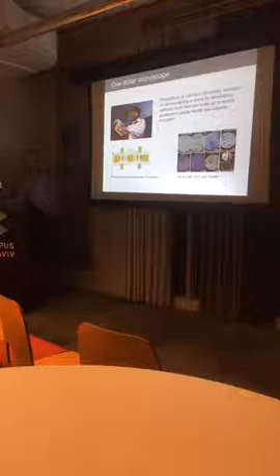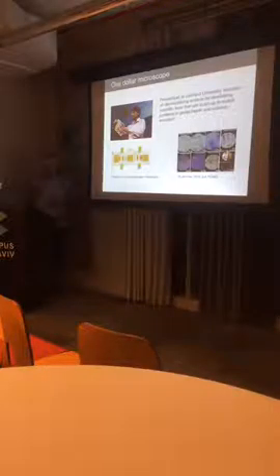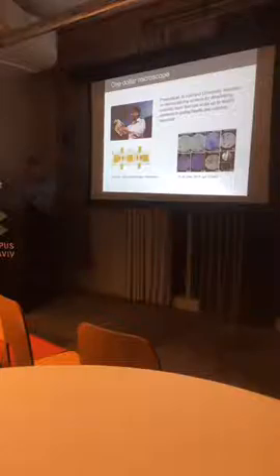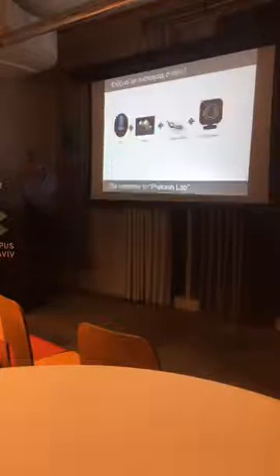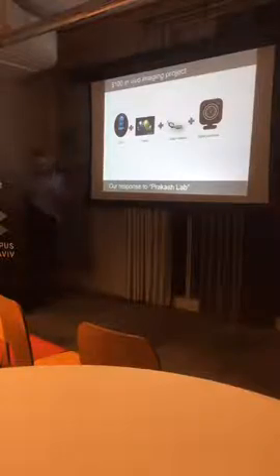But of course, as I mentioned before, it is for the samples that you put on the slide. We cannot use it for in vivo imaging. But what we can do for in vivo imaging, and I would like to show you, is use something a little bit more expensive, but still affordable.